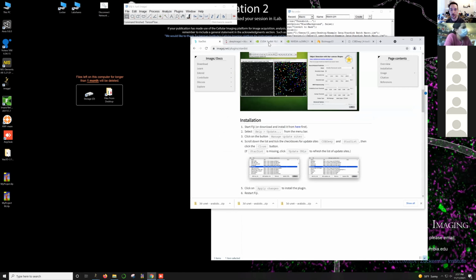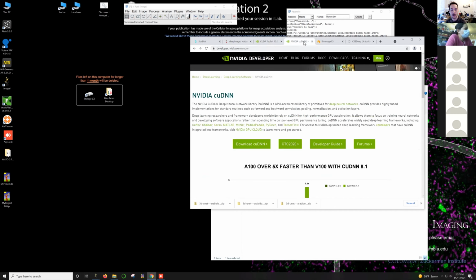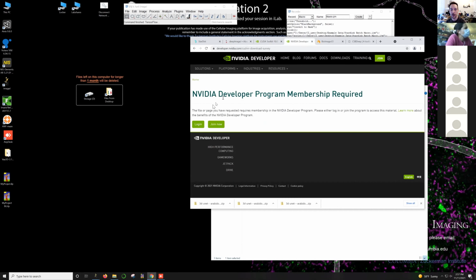And it's very easy to get access to this stuff. The CUDA toolkits, you can just Google search. You'll find an archive if it's an older version that you need to use. Like in this case, this is a little bit older now, but this is the one we need for this. The neural network tools are not immediately available for download, but all you have to do is create a login account with NVIDIA, and there's no real barrier to doing that. Once you've created an account, you'll be able to download the DNN tools. And there's an archive list there for all the different versions that you need. So once you've done that and enabled the TensorFlow and you have a GPU, then it should be using the GPU, and you'll get some feedback if it's not doing that.